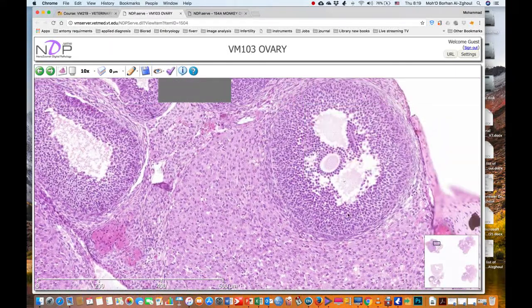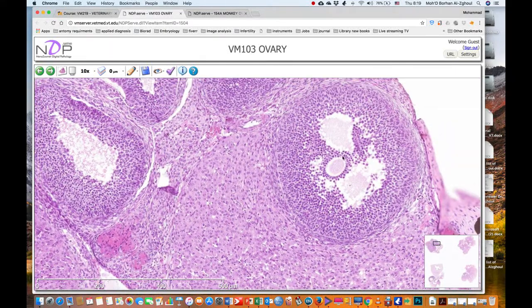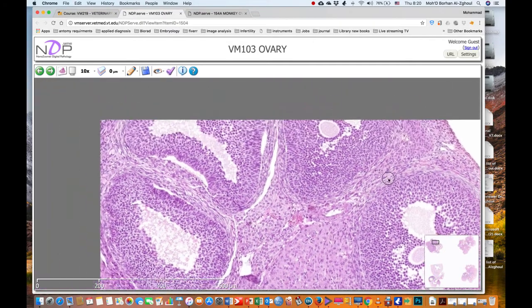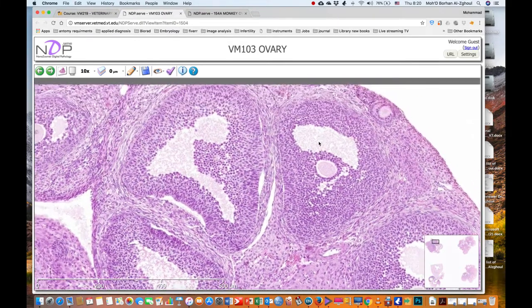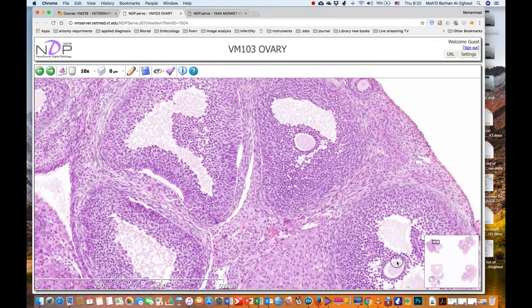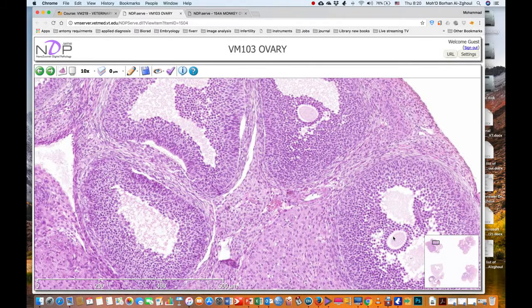If we go to this one here, this is the pre-antral stage. We can see that the spaces between the cells coalesce to form different spaces, and we can see here the oocyte still in the central. These cells now change from the name of follicular cells into granulosa cells. Again, we have the theca interna, we have the theca externa. Okay, again, this is the pre-antral. See here the space, and very important, still the oocyte location still in the center.